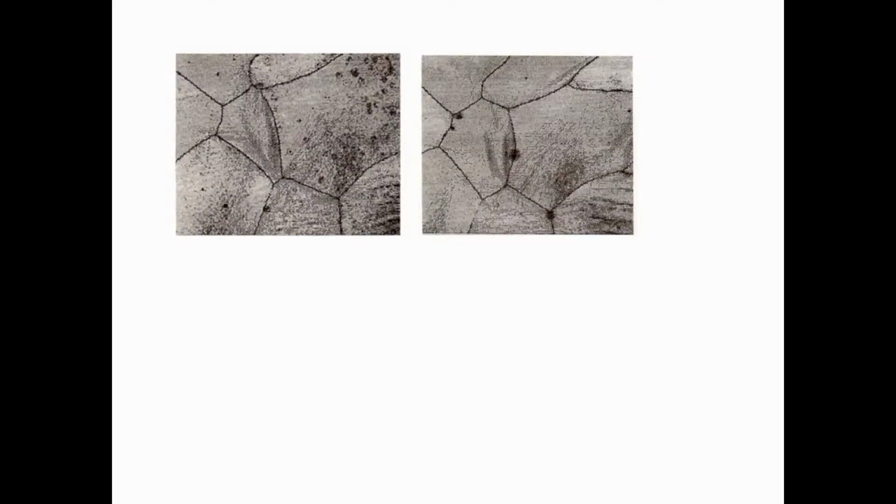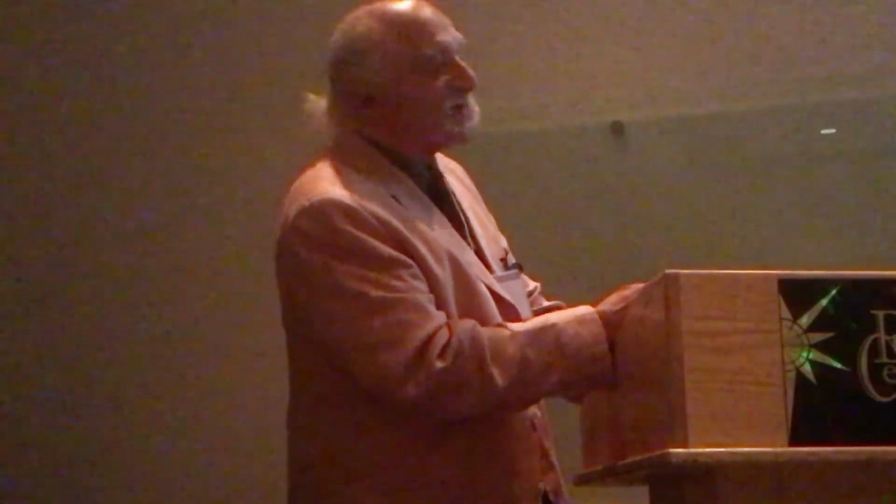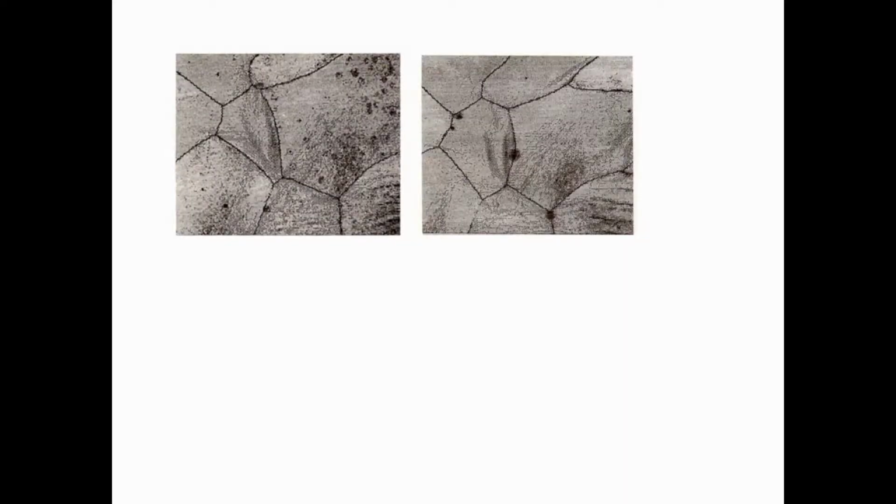Now, during all of this work, out came the image quality. And by the way, if Carsten Kunze is in the audience, you took this with me, if you might remember, one afternoon in Utah, BYU, and it's a serial section through a sample, serial done by mechanical polishing, and it's an image quality map.